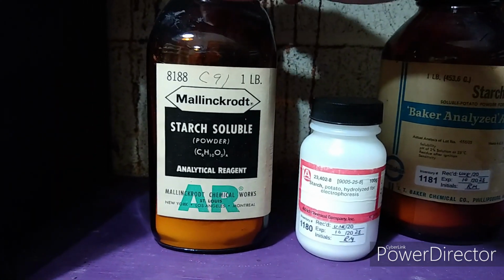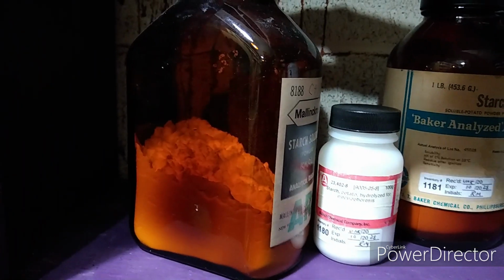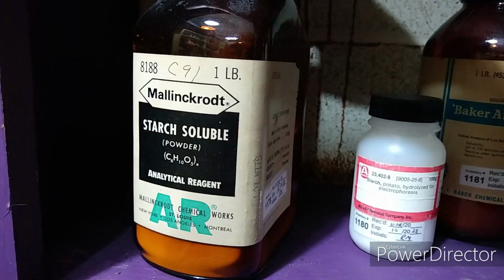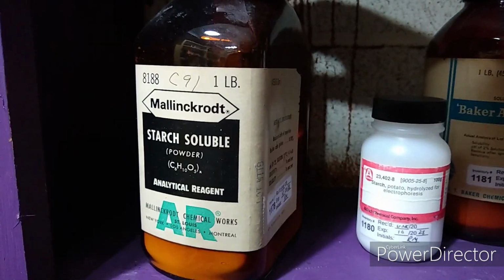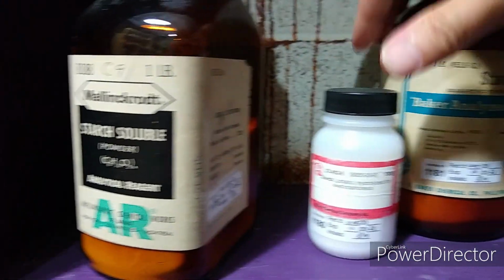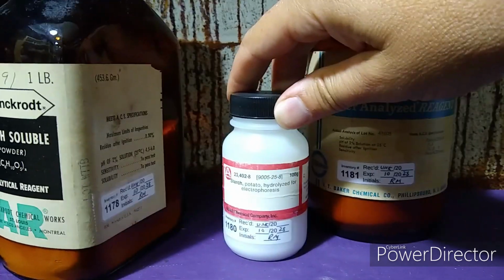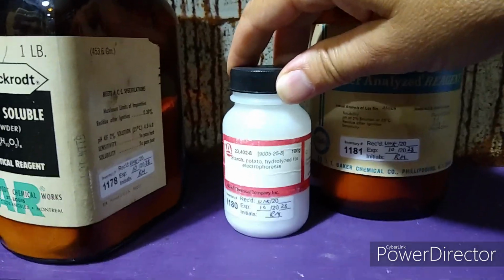Let's try the starch soluble. Don't know where this comes from, either potatoes or corn or something. I think I'll try that one. No, I better go with potato. I think that's the one I've used before. It's good not to change if you don't have to.